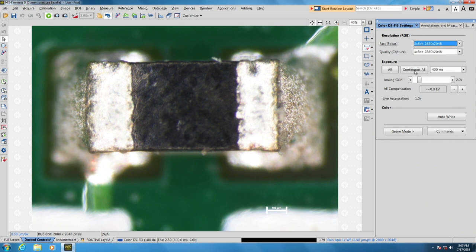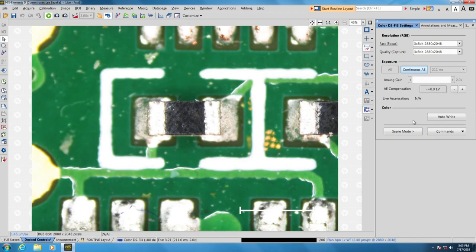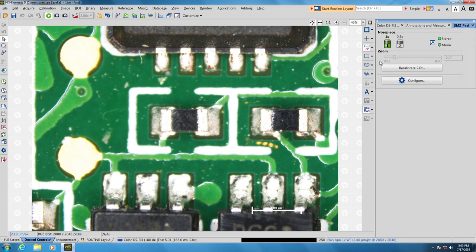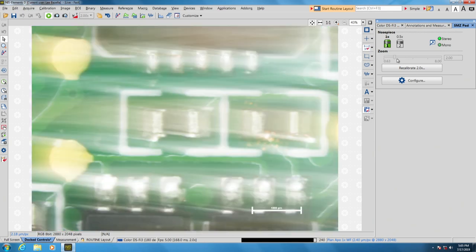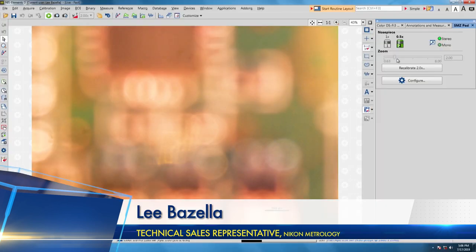We have auto exposure and continuous auto exposure. Continuous auto exposure is something you might want to use as you zoom—as you go down, it adjusts the exposure on the fly. You can also see the different zoom levels displayed, and when you rotate the nosepiece, it shows you it's on the 0.5x now and adjusts the scale bar accordingly.